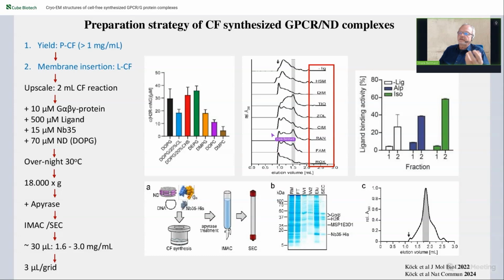The rest is sticking out of the nanodisc, and these particles have absolutely no chance to fold in a functional form. So the interesting and folded fraction you see here, this is completely integrated, and you can see that by addition of diverse ligands, you can even modulate the amount of these folded fractions. That is a histamine 2 receptor.